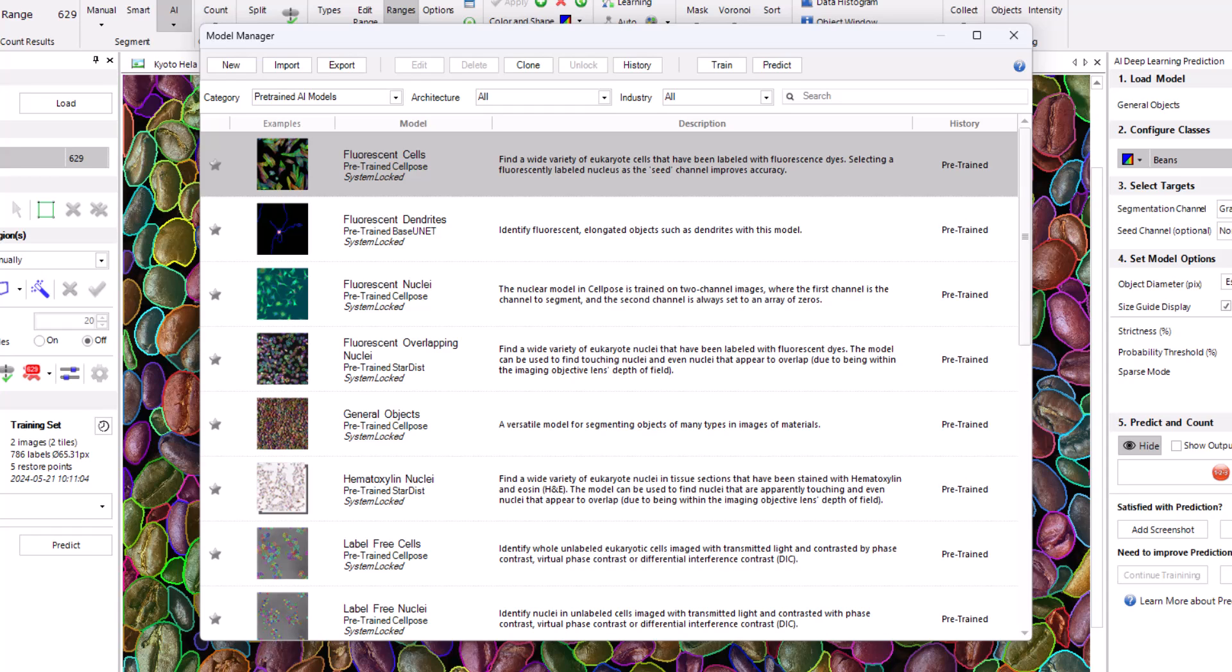clone models, and lock models, which protects them from further changes. You can also use the model manager to load a model in either the training or prediction panels.